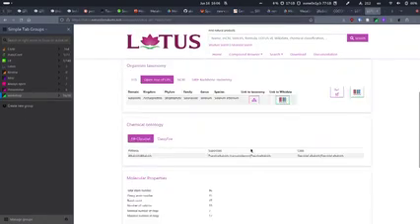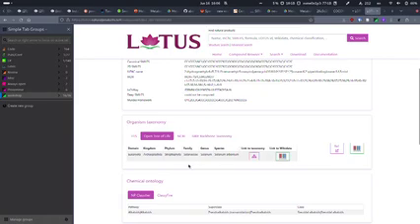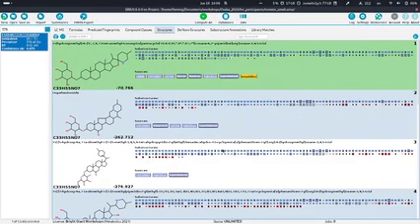Okay, because we don't have so much more time, I'm not going to wait on this, but what you could see on Lotus is, okay, I can show it. So what you can see here, you have measured this in these species, and if you know more about biology than me, you know that this Solanum is nightshades, which fits very well to the data we have, which was measured in tomato plants. And also, we named our custom database tomatidine. So we are expecting some tomato compounds here, which we have apparently found.